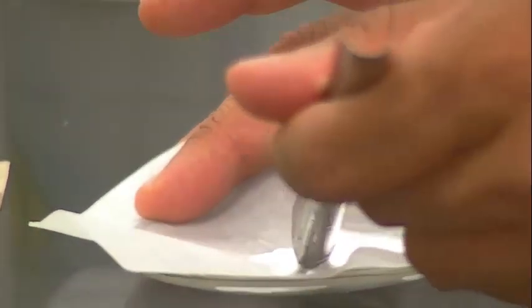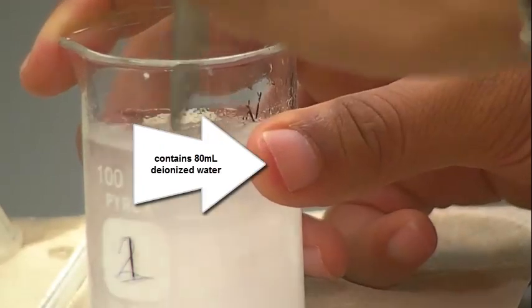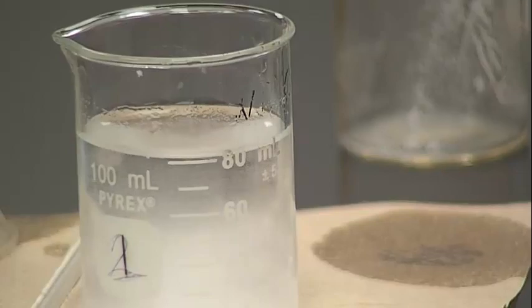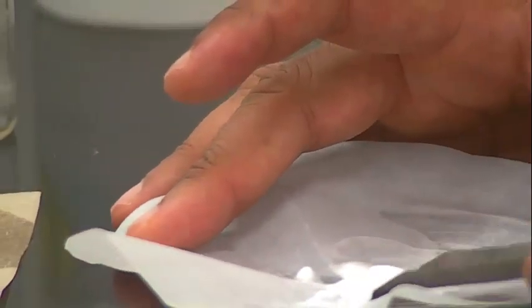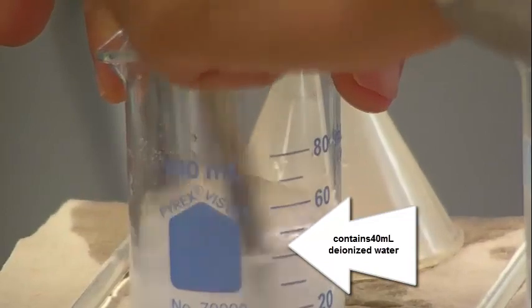And I will take one little chunk and put it into a beaker that has 80 mils of DI water. And I'll take the second chunk and put it into my beaker that has 40 mils of water.